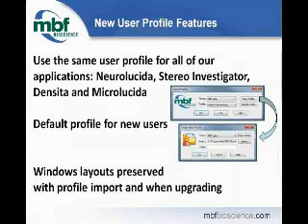So carrying on, user profiles made an appearance in version 9, and the profiles were designed to handle multiple users within a lab or within a core facility so that you could set up the workplace, the workstation, as you wanted to. So if you had named all your markers, you could retain those even when the next person in the lab launched the software and changed the markers for their purposes. So we've made some improvements to it so that it's easier to use and has a bit more power.